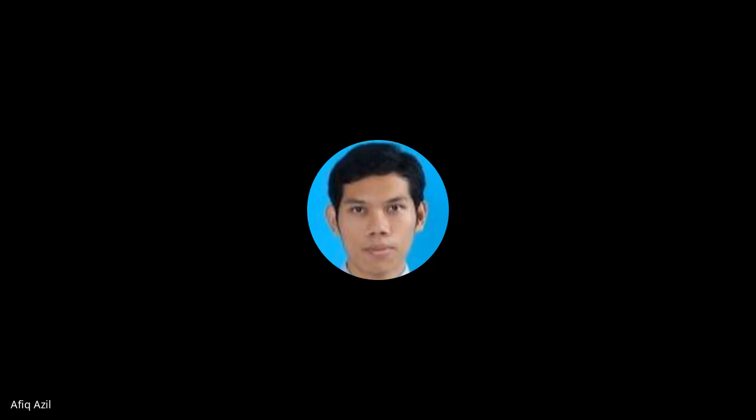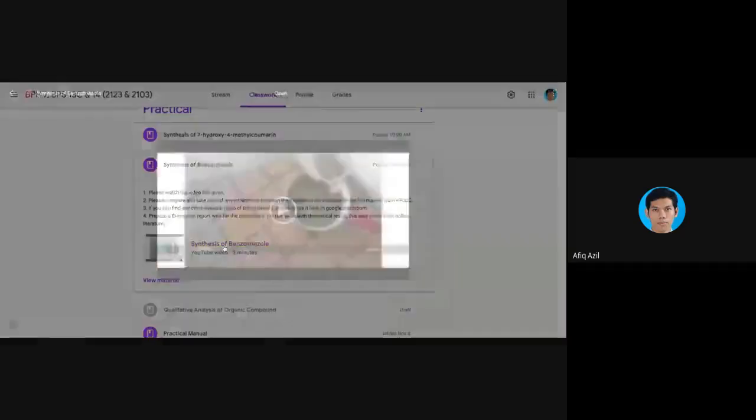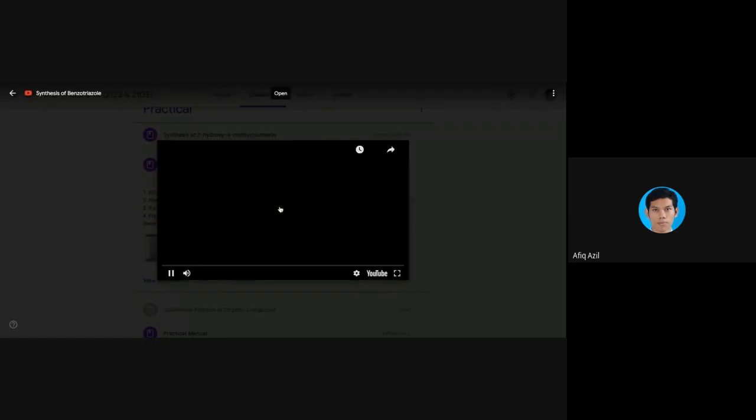One minute. Let me share the screen. Synthesis of benzotriazole.